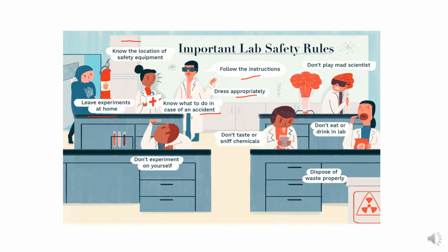And of course don't play like a mad scientist, as I mentioned in the last slide. If you don't know about any chemicals, don't do that, and don't do a new chemical experiment. Okay, and of course eating and drinking is not allowed. This is the very basic rule about working in the lab.